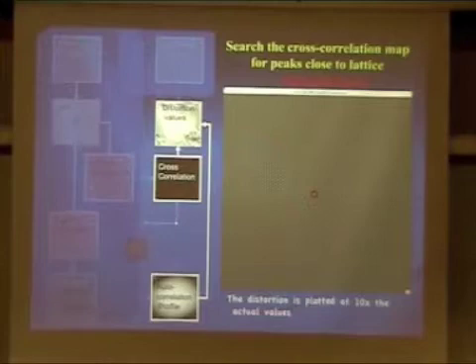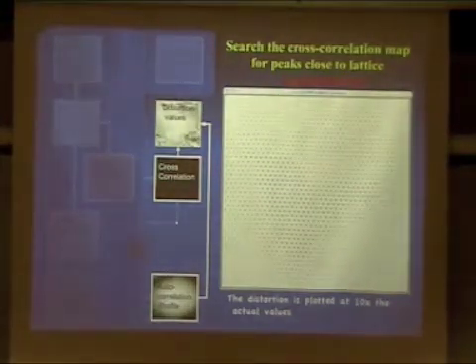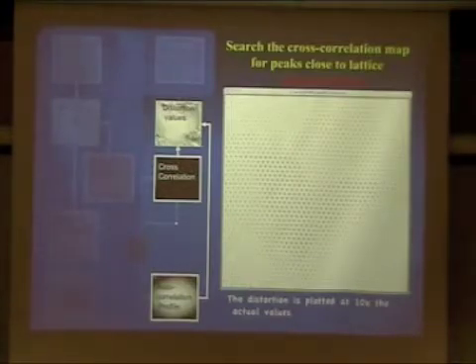So then we put that profile, because the actual size is only the same as all the other peaks. And you just search along different directions. By doing so, you basically create your map, a list of the positions of each of the peaks, and also its height, compared with your autocorrelation profile. So this is the kind of output that you end up having.